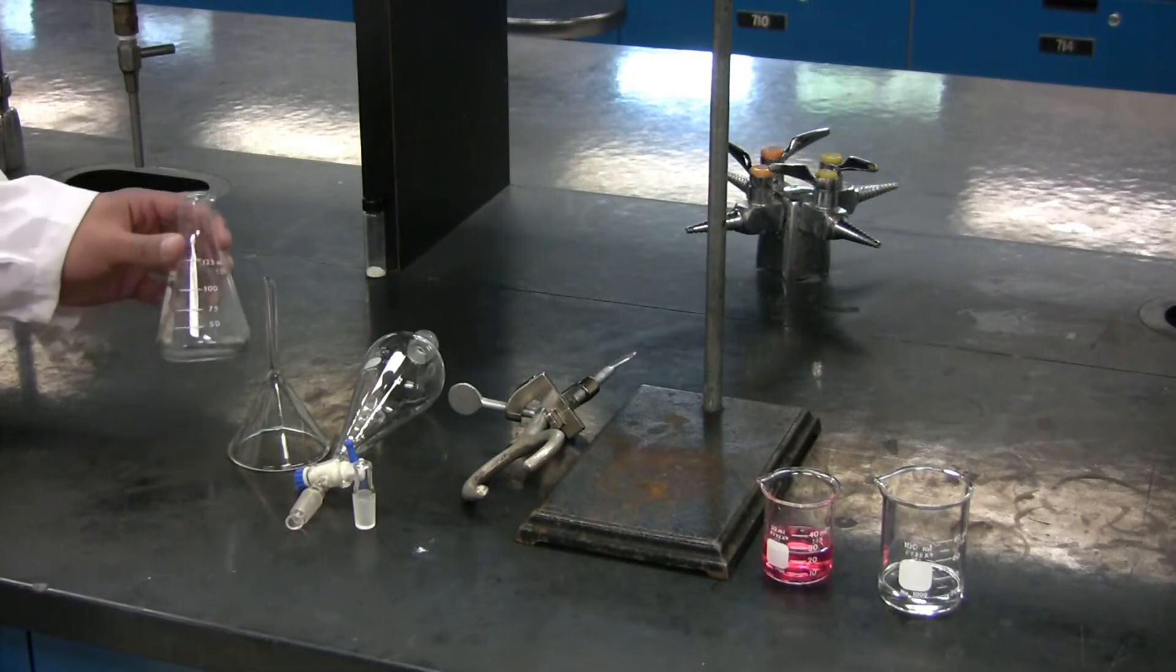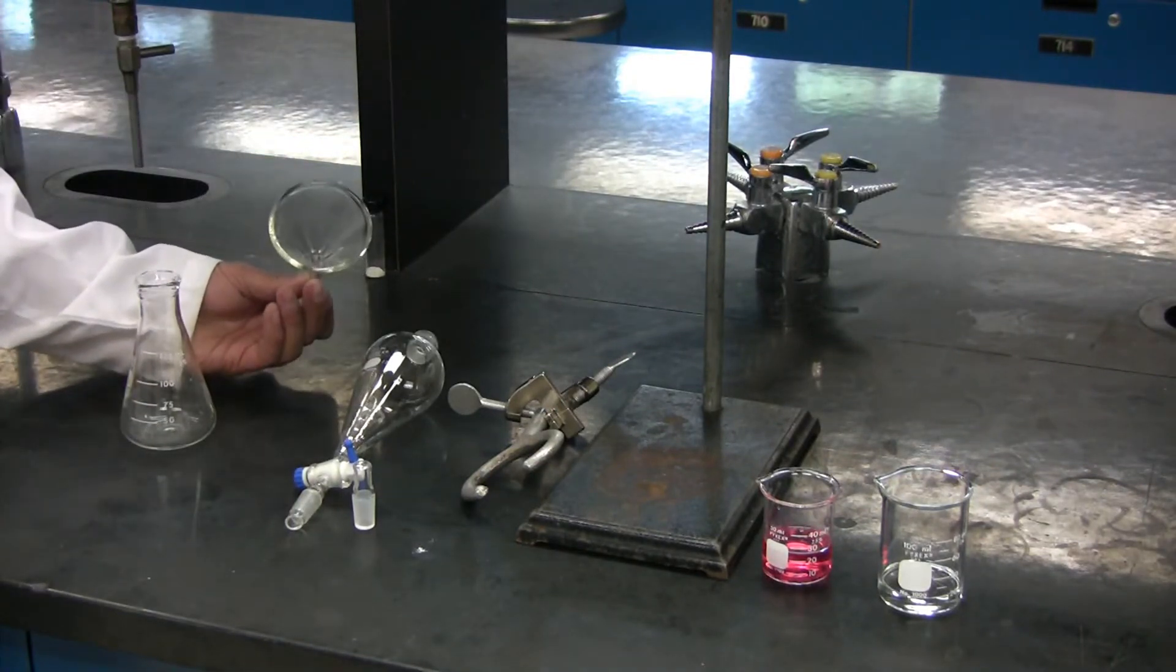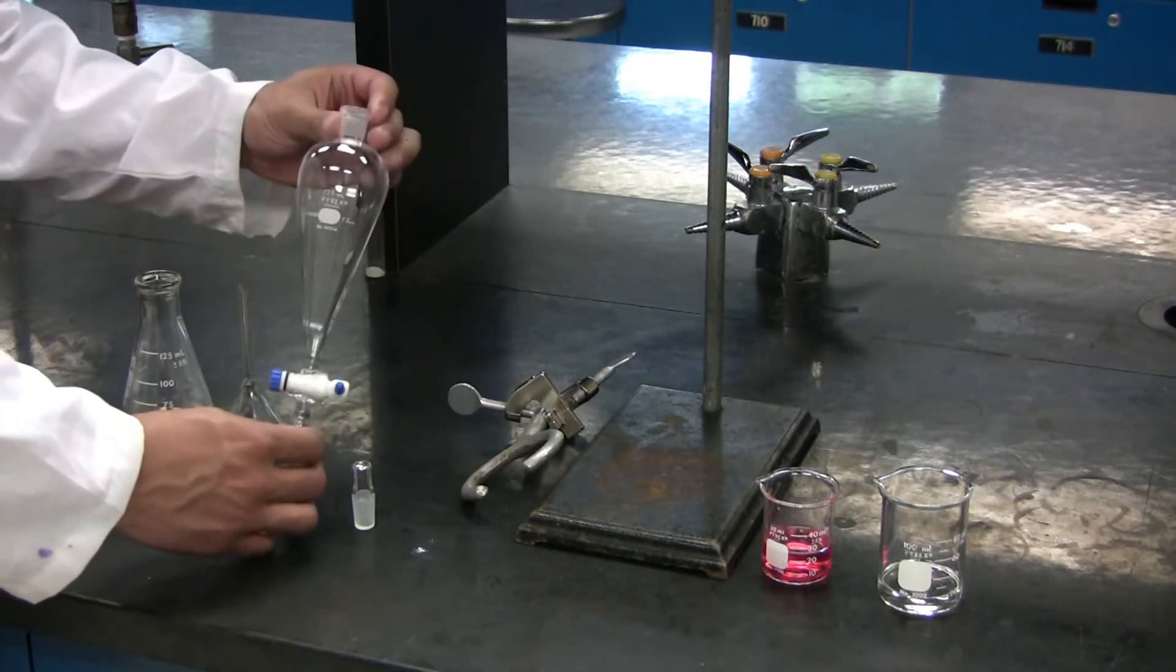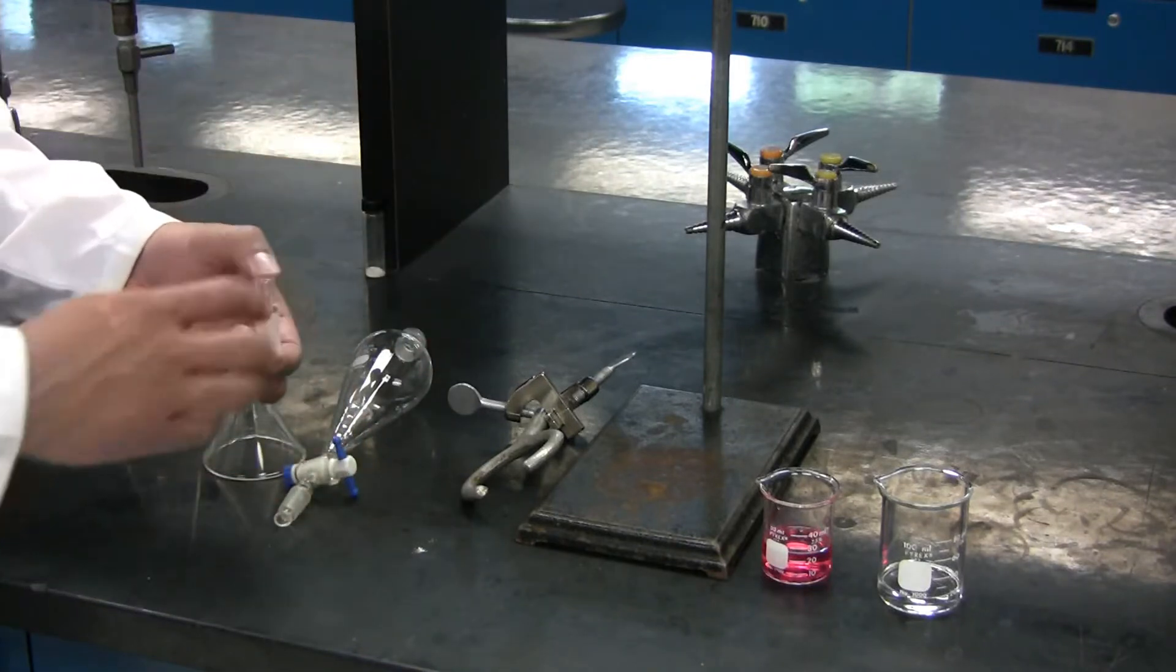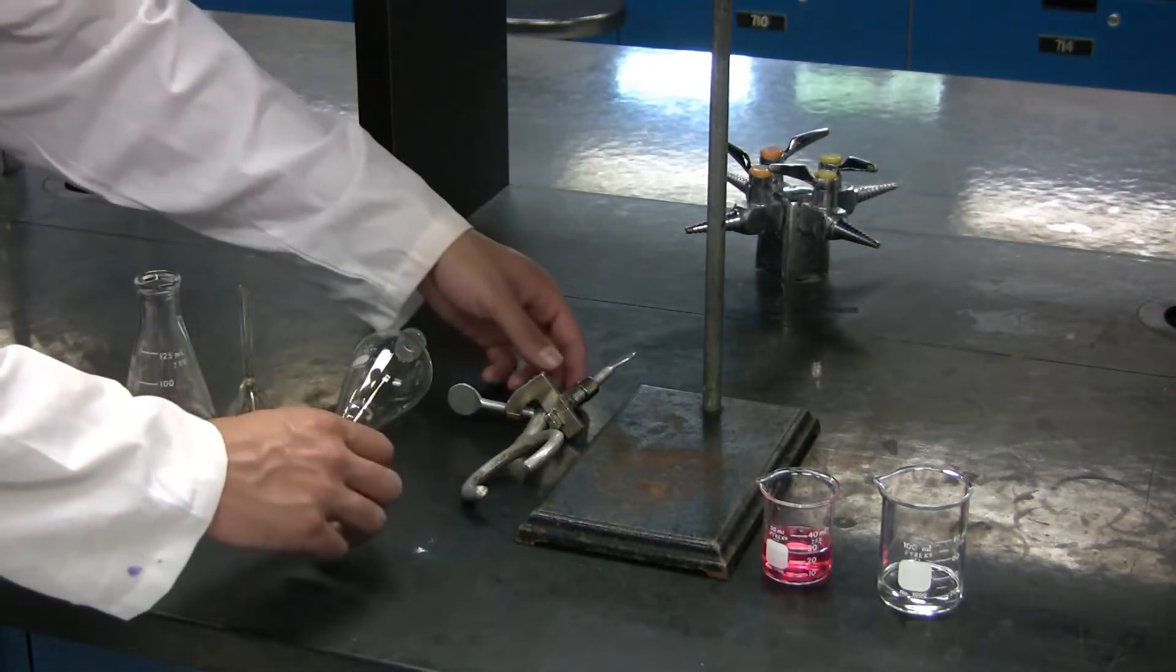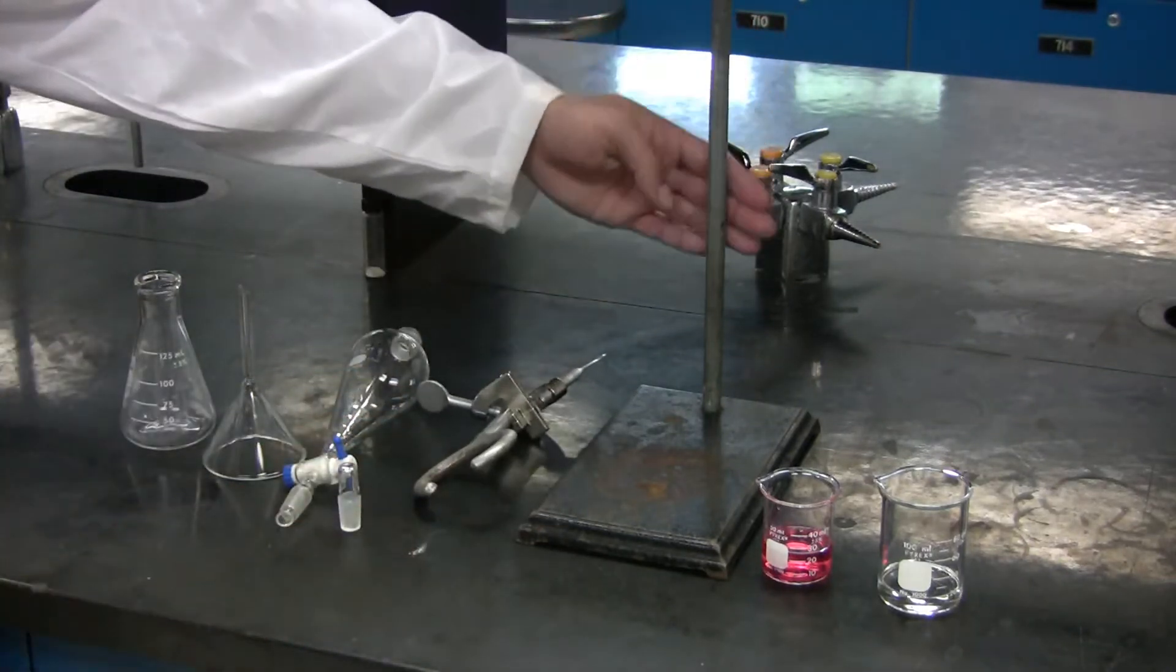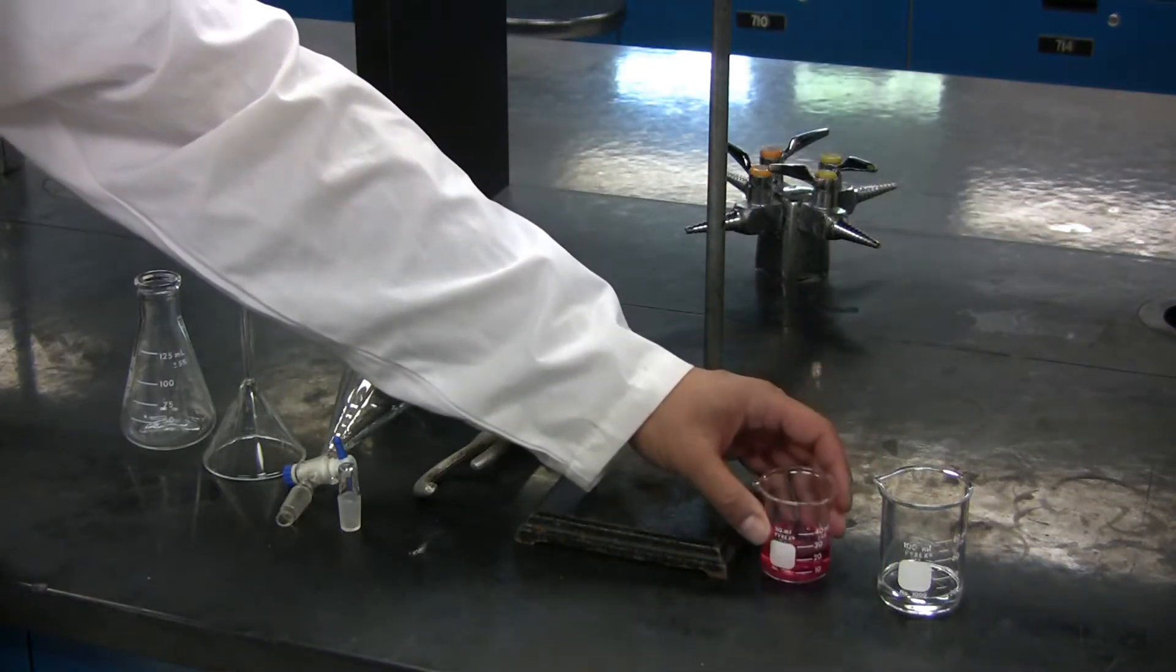You will require an Erlenmeyer flask, a glass funnel, a separatory funnel, a glass cap for the separatory funnel, a ring clamp, a retort stand, and your solution and solvent.